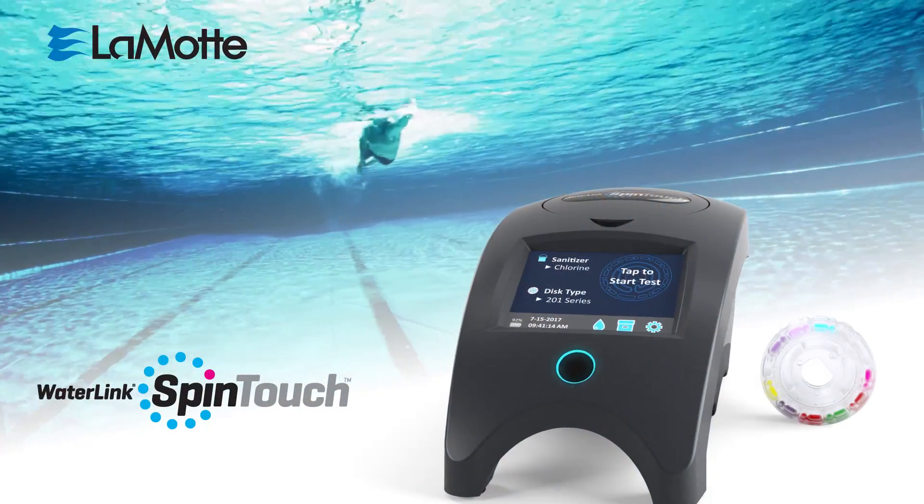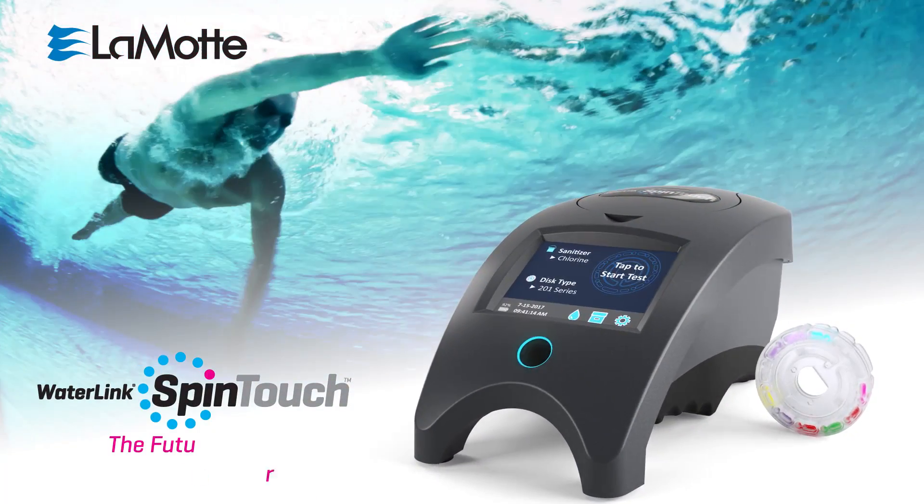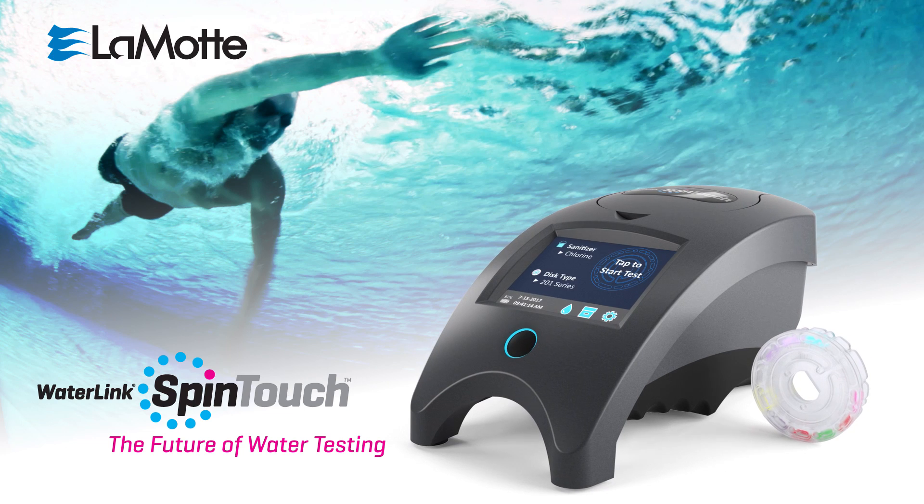The game-changing WaterLink Spin Touch with centrifugal fluidics reagent disks. You'll never test any other way.